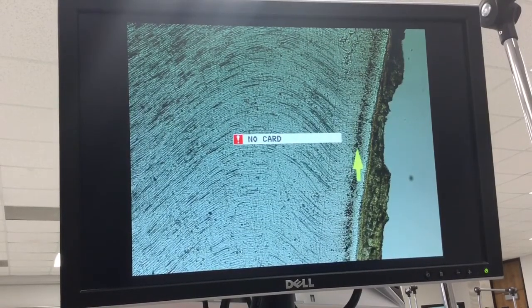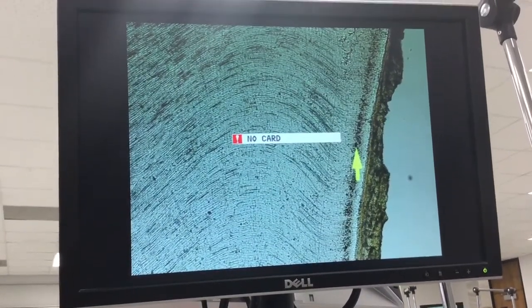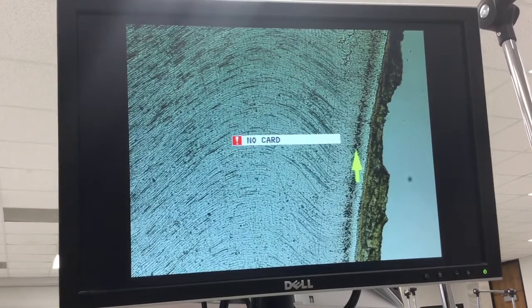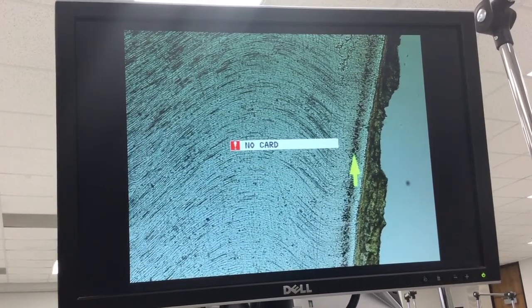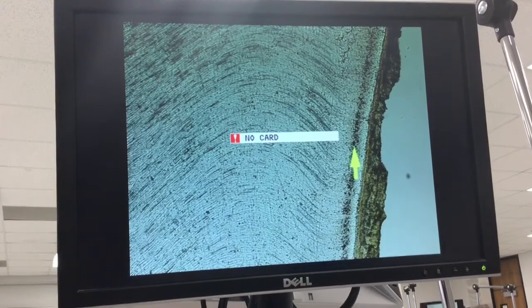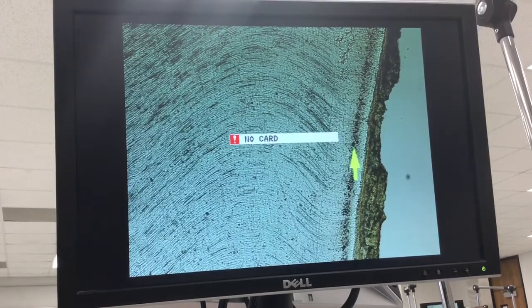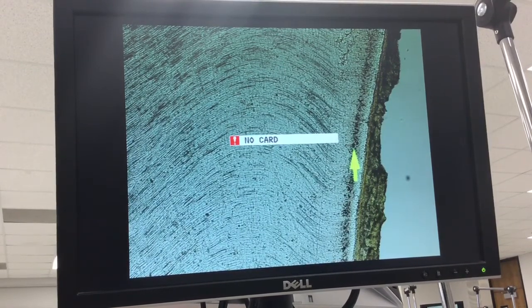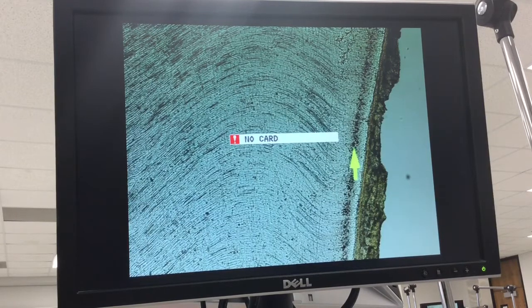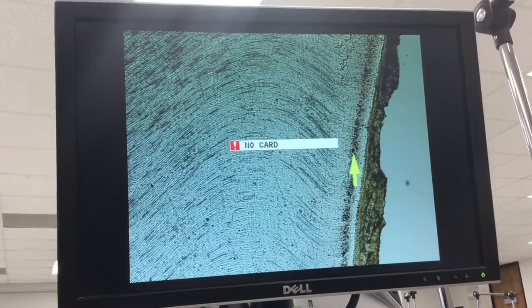Okay, and I also have a couple of demonstrations up in front here. I have some stereo pairs taken with the scanning electron microscope showing a dentinal tubule, and I have a stereo viewer. And the stereo viewer is this small pair of almost like glasses. It has two prisms. The prisms go towards the micrograph.